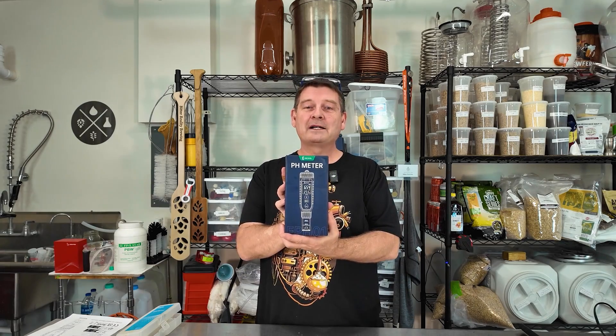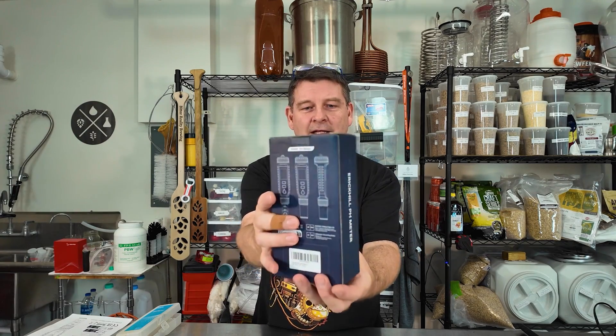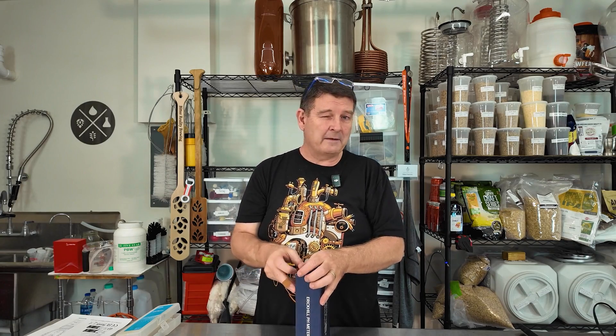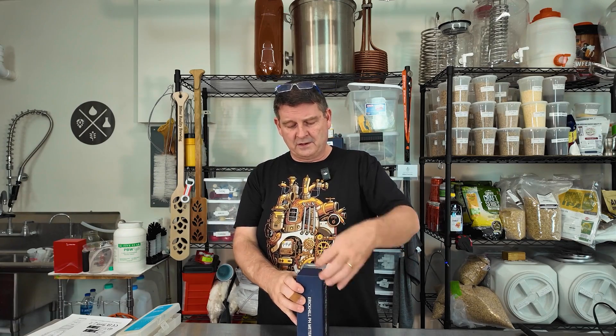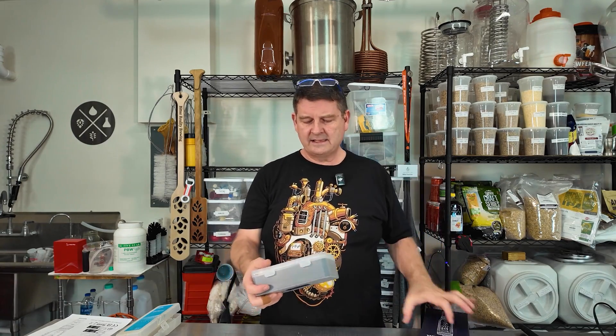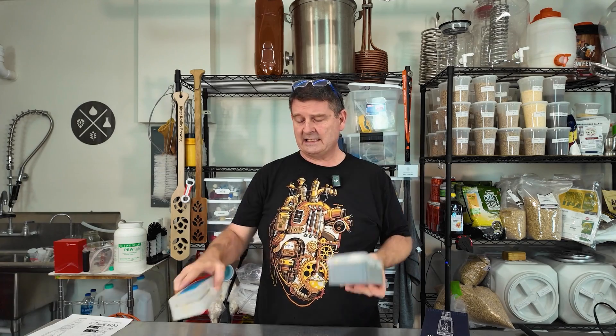So we're gonna do an unboxing — I'll show you the front, side, and the back. It's a very very nice pH meter and it comes with pretty much everything you need, and I do mean everything you need. So you open it up — a nice case, everything's packed in that case. Significantly different size case, more stuff in this case.